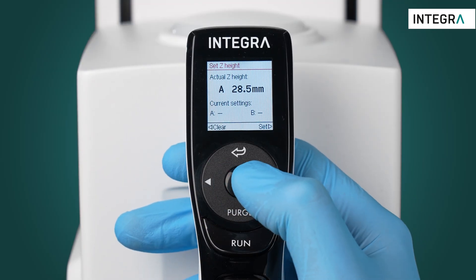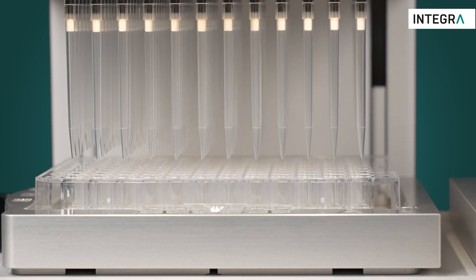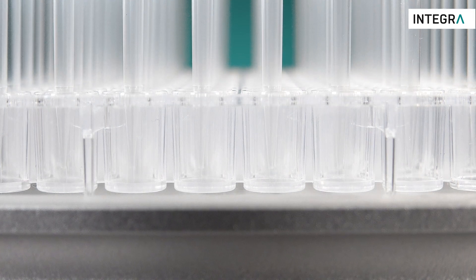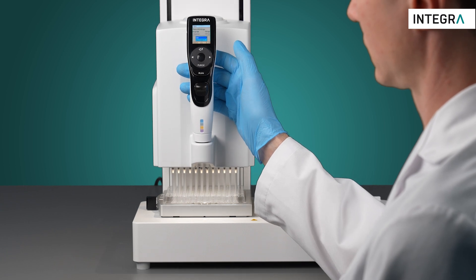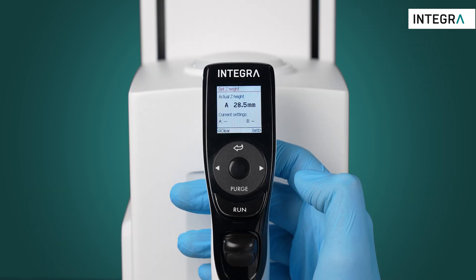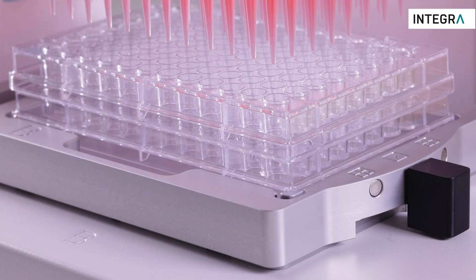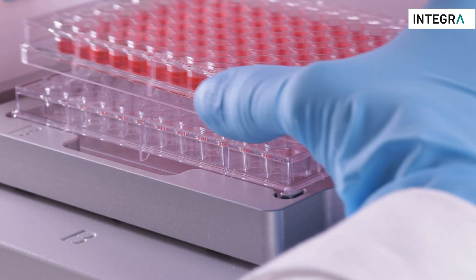Setting a Z-height will also ensure that the pipette tips do not go below a certain height. This is especially useful when defining the bottom of your labware. A different value can be set on both positions A and B, or if multiple heights are needed — for example when stacking plates — a custom program can be used to program multiple heights.